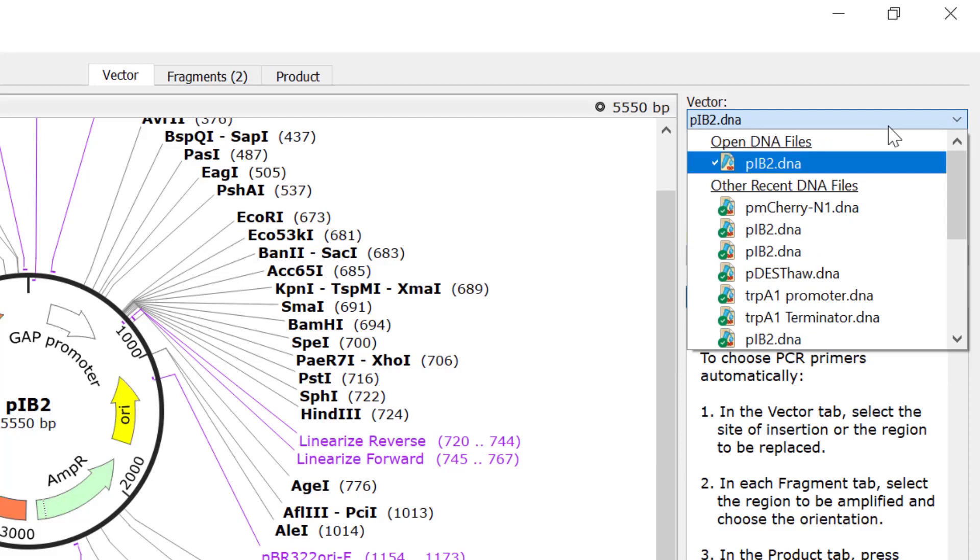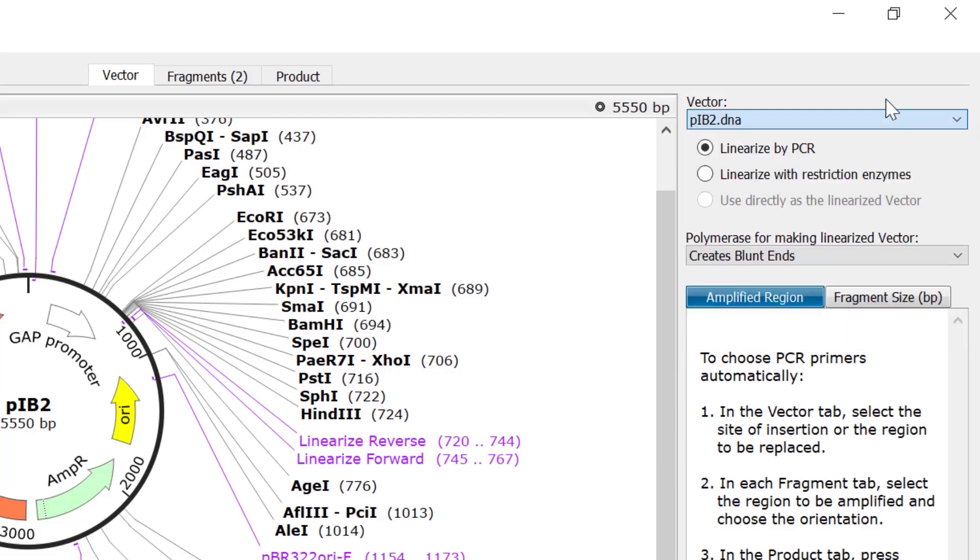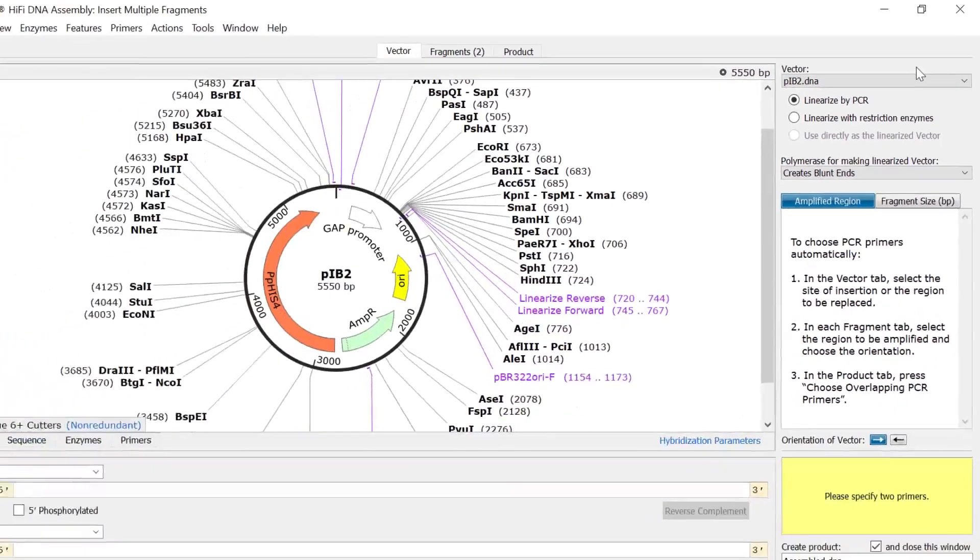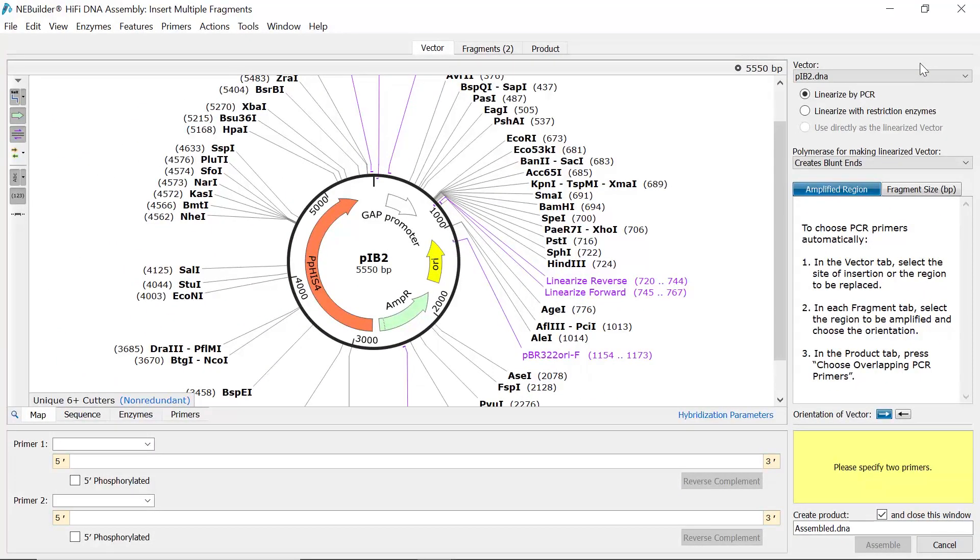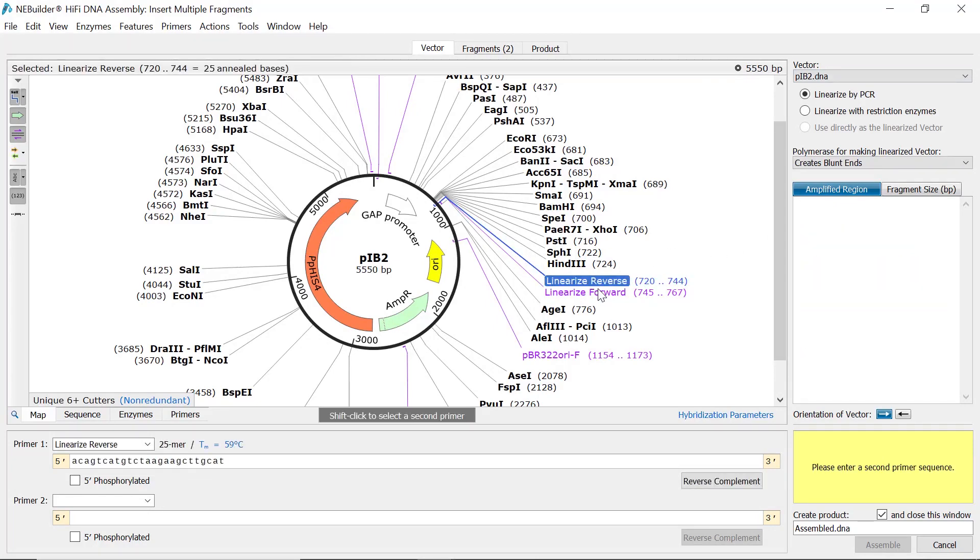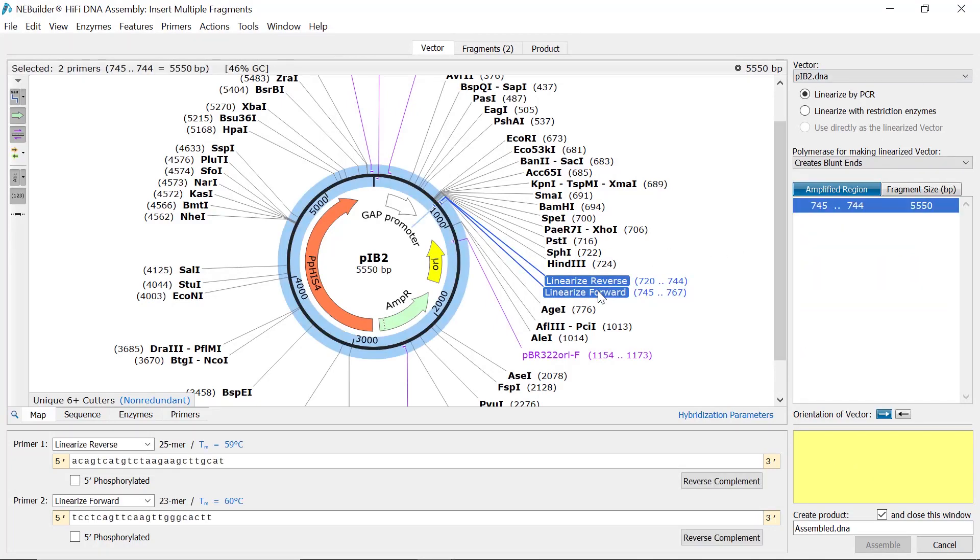Next, select the desired method of linearizing your vector, either through PCR or restriction digestion. To linearize by PCR, simply shift-click on the two desired primers in the map view. The amplified region will then be highlighted.